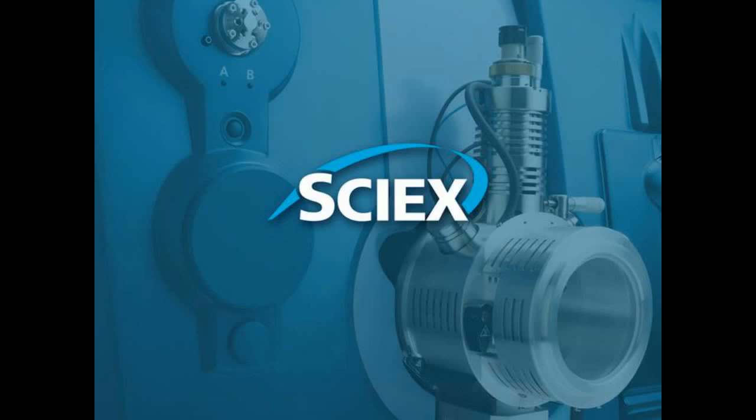Here your ion generation is really high, but you're actually injecting a lot less. In reality, from some of the testing I've recently done, CESI-MS can be equivalent to about a 5 microliter injection by high flow LC-MS. So the low volume injection onto the capillary is countered dramatically by the high efficiency of ion generation you get at these low flows.